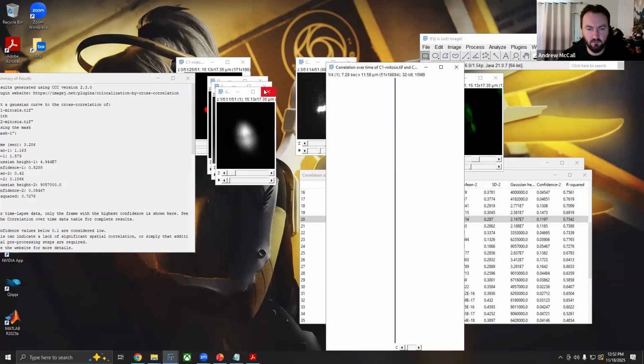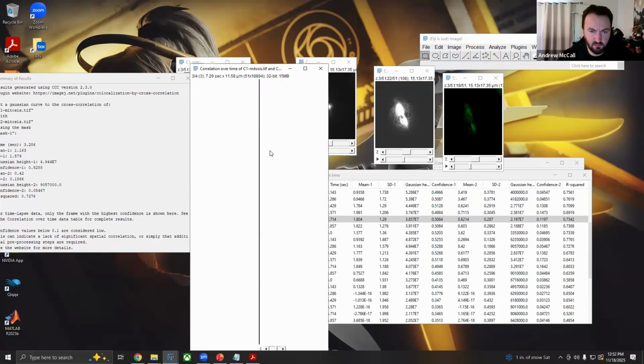One other unique thing here is this is the correlogram that we have. I need to rename this. This is our correlogram. It's actually an image, and originally it's going to be really hard to read. And this is because this axis here, our y-axis, is the distance axis, which can be absolutely huge, as I already showed you. So the 51 here is our time axis. So we're looking at time over distance.